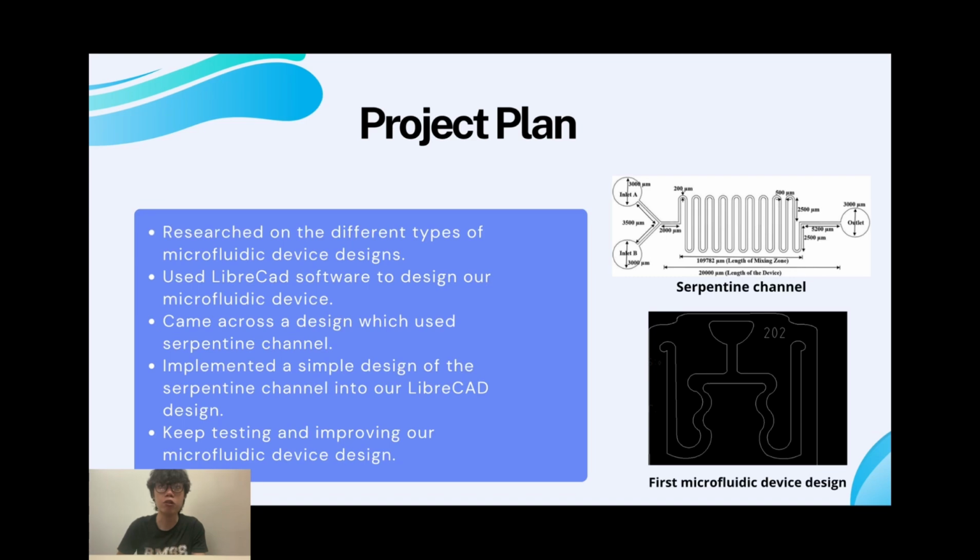For our project plan, our group decided to research the different types of microfluidic device designs which would be suitable for our experiment. We used the LibreCAD software to design all of our microfluidic devices. During my research, I read that the shape of microfluidic channels is very important in deciding the behavior of the flow, and such channels are designed to ensure efficient mixing of reagents, samples, and to minimize dead volumes.